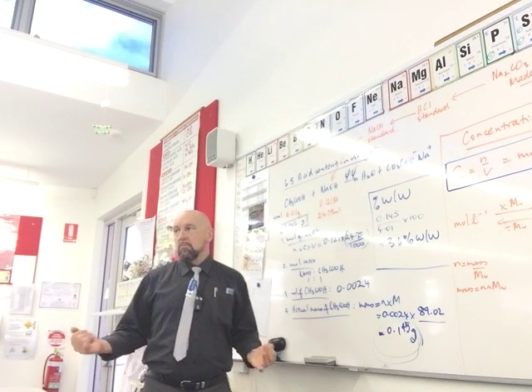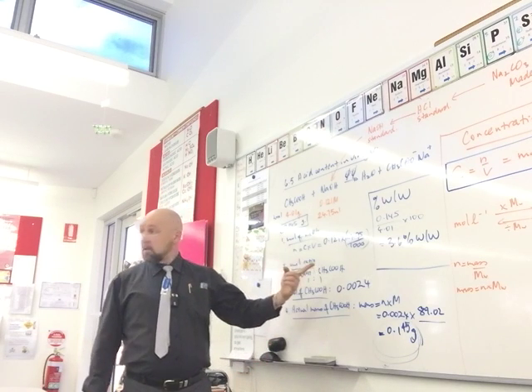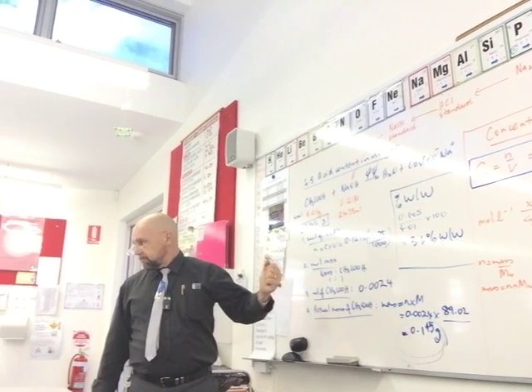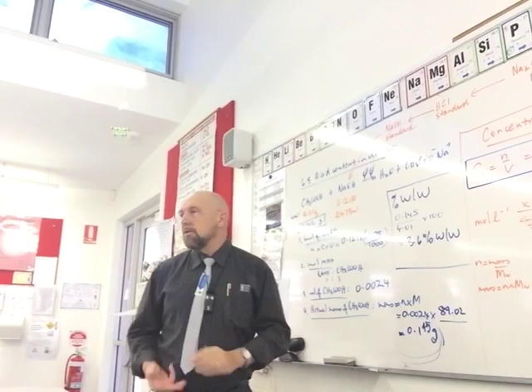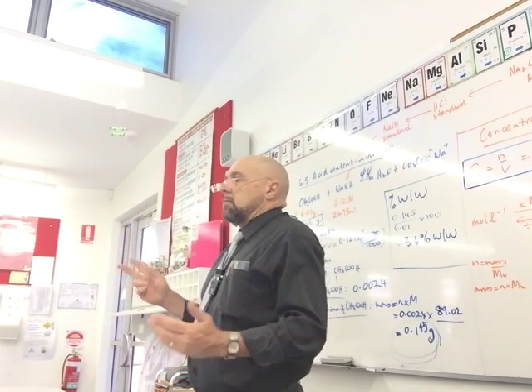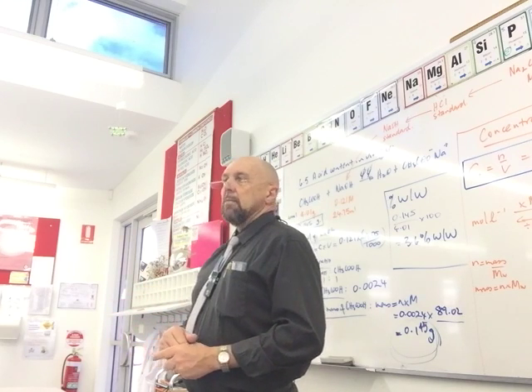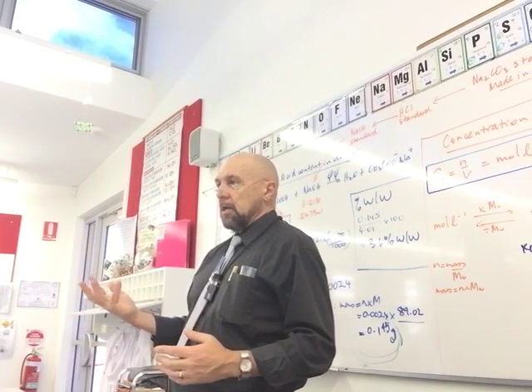All right, so we're going to use the weight by weight. If we have different masses, which one do we use? It's a good question. So if you do 3 titrations, I think the book asks you to do 2. It's probably not any advantage doing any more than 2, unless you really miss the end point, which is that pale pink.